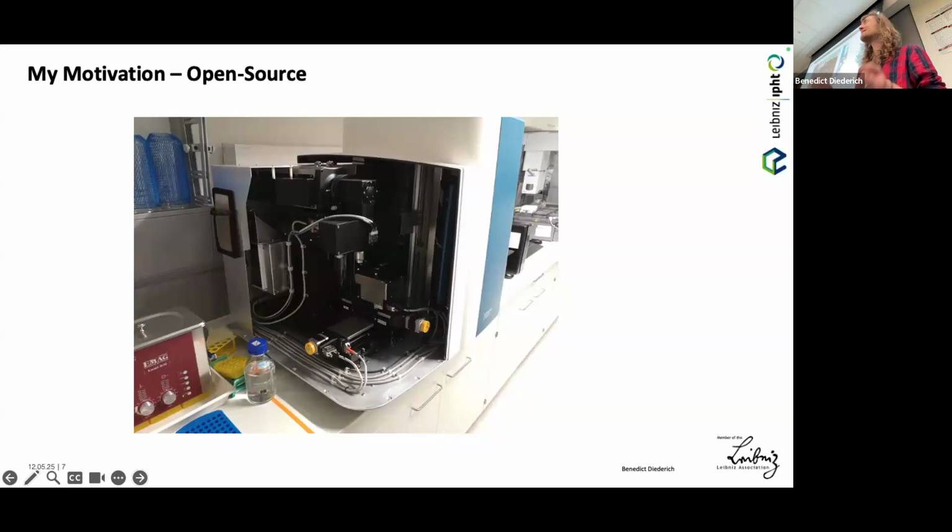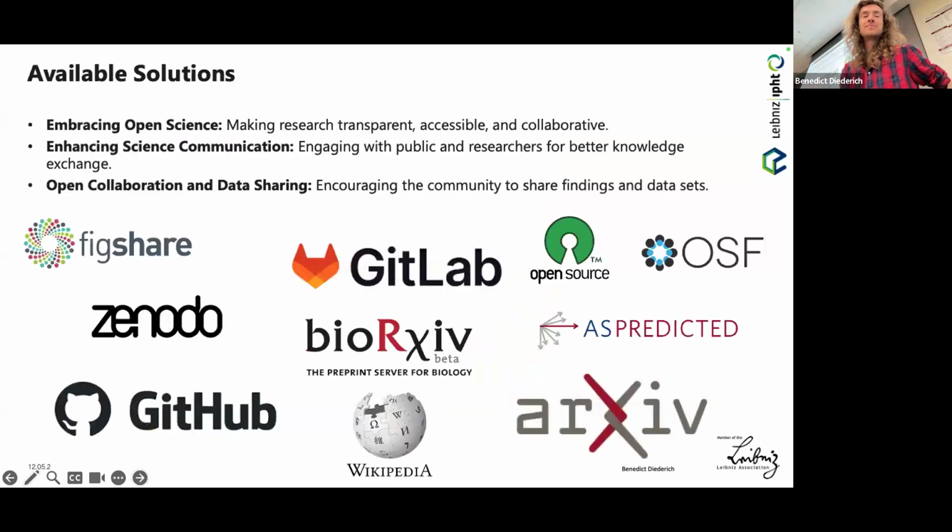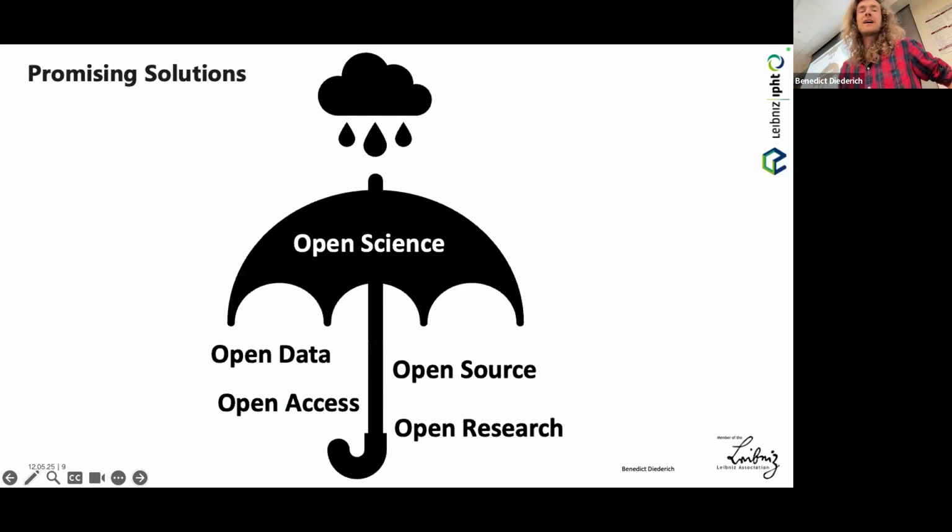And imagine if something was open, you could just use it and manipulate it. We still have high hopes that we can make it alive again with open source tools like Micro-Manager and all these things. So it's just for you to consider, hey, open source has many nice aspects. Tools that you use, I don't need to go over these, but open source is like an envelope, and that was something my research group was doing. Open instrumentation was something I was doing.